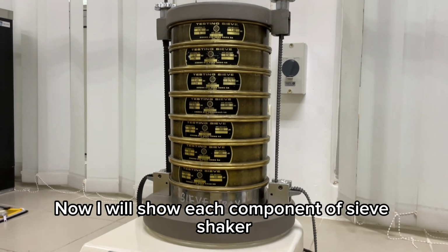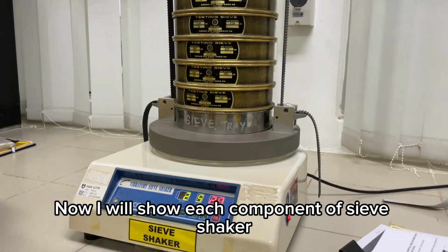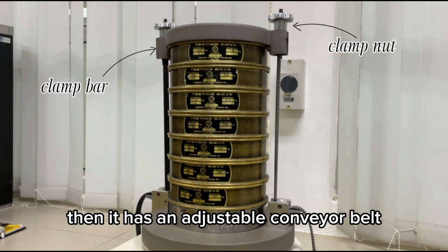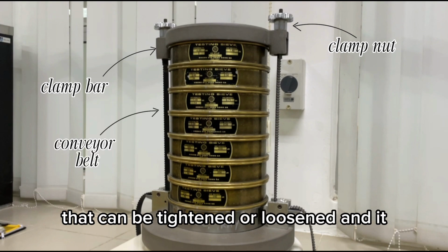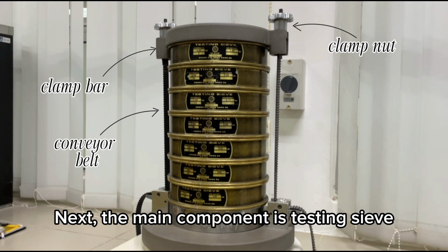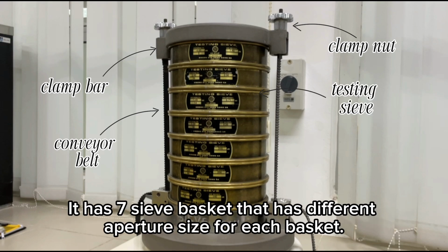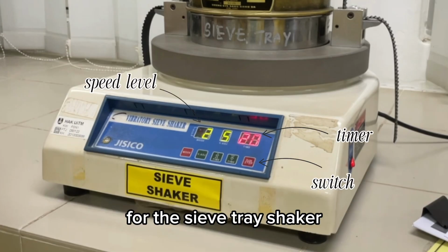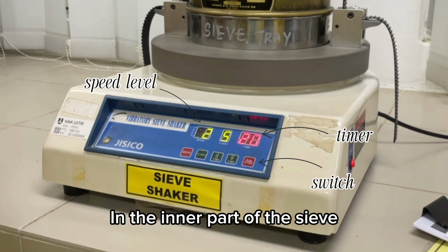Now I will show each component of the sieve shaker. For the top part, we have a clamp bar and also the clamp nuts. Then it has an adjustable conveyor belt that can be tightened or loosened, and it is attached with the clamp nut. Next, the main component is the testing sieve. It has 7 sieve baskets that have a different aperture size for each basket. For the bottom part, it has a timer, switch, and the level of the speed for the sieve tray shaker. In the inner part of the sieve, it has a vibration motor.